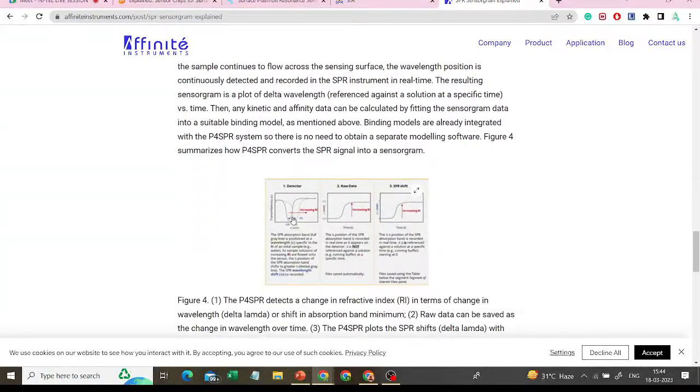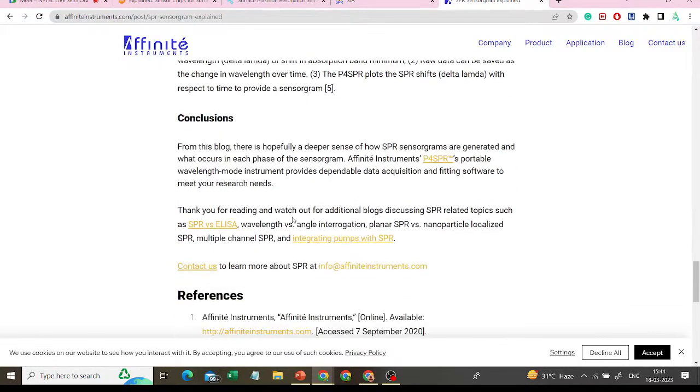I think you are clear on what your off rate and on rate are, and you can determine the KD, and then the association, steady state, dissociation, regeneration, and the baseline. The baseline gives you an initial system check, that there is a flat line and no analyte is binding, so there is no instability from the system or sensor chemistry point of view.